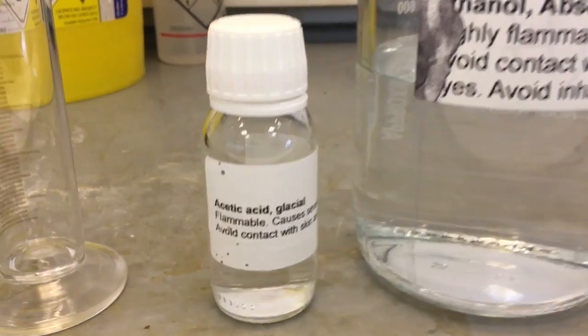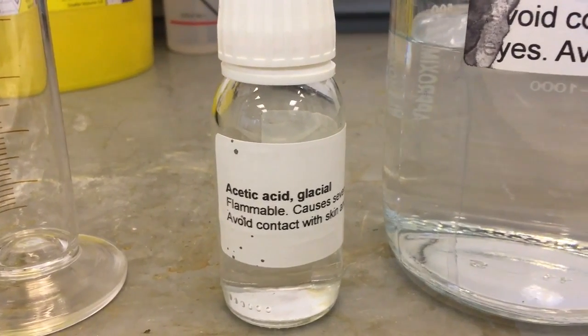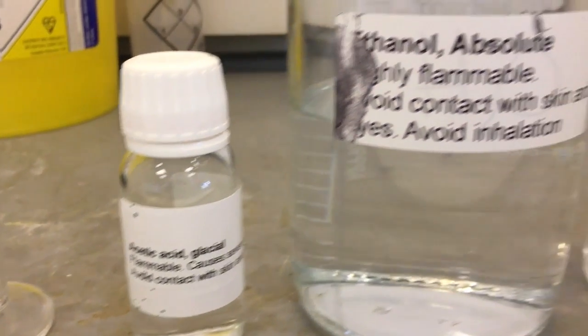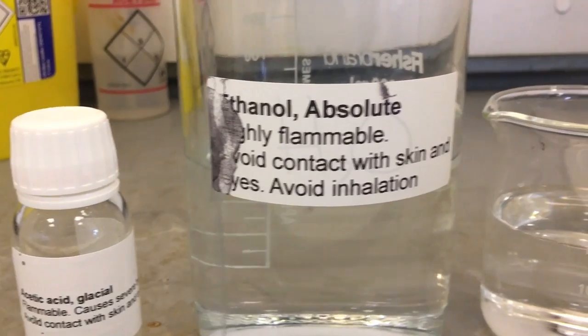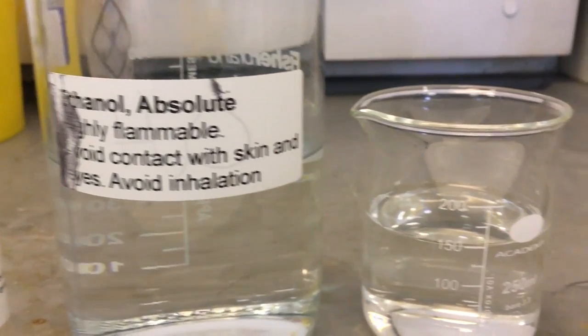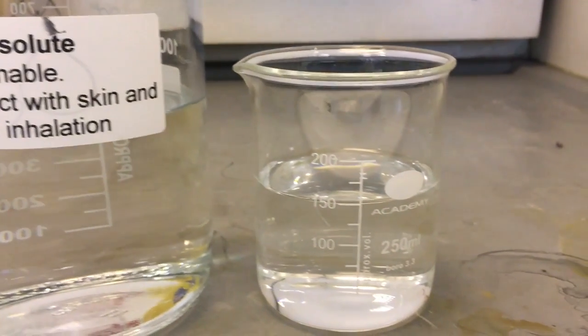The first thing we did was create an extraction solution, which consisted of acetic acid, ethanol, and deionized water. This will be used to extract the antioxidants from our smoothie samples.